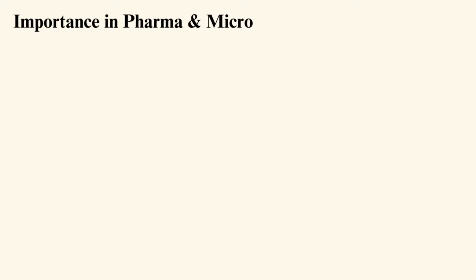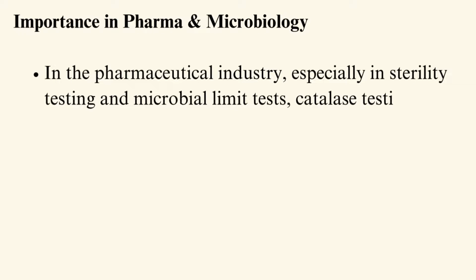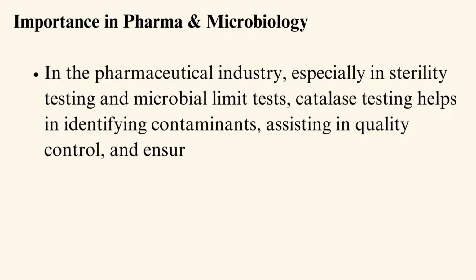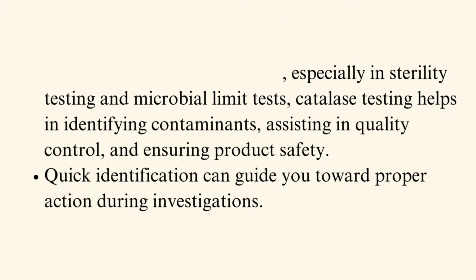Importance in pharma microbiology: in the pharmaceutical industry, especially in sterility testing and microbial limit tests, Catalase testing helps in identifying contaminants, assisting in quality control, and ensuring product safety. Quick identification can guide you toward proper action during investigations.